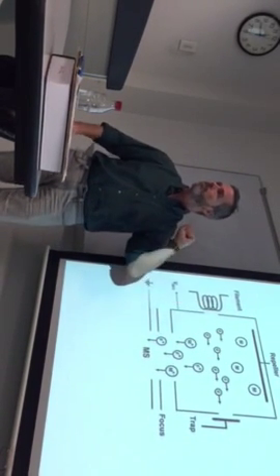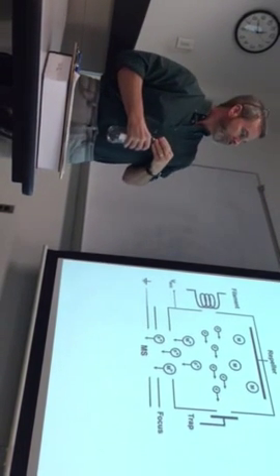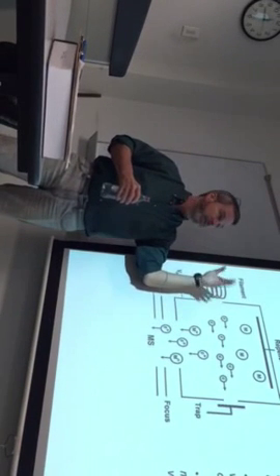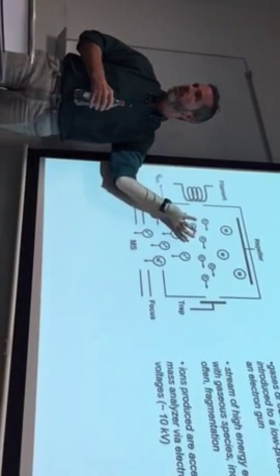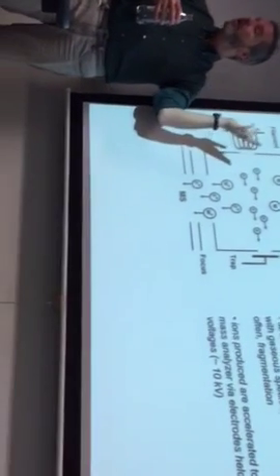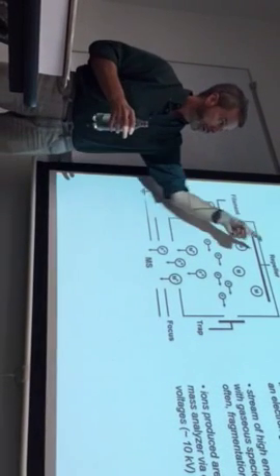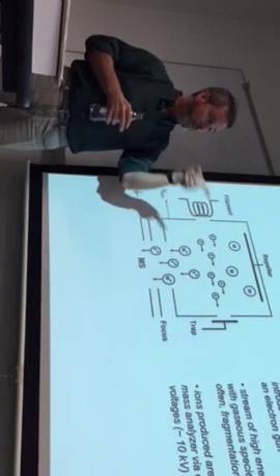So inside this, oh, yes ma'am, go ahead. So the M is crossing through the electron stream, and not on purpose, okay. They're just up there in the gas phase. We introduce gaseous molecules to this ion source, in this vicinity right here, and they're diffusing around, and they're going to encounter the beam. Oh, don't get me wrong, it could be that we introduce them by flowing in the gaseous molecules at a certain velocity, and we can certainly point the output of our inlet towards the electron beam itself.